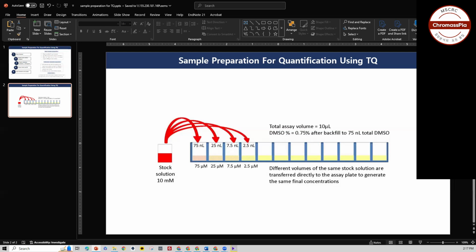Okay. Really, I agree with Imran. When he said that preparing the standard solutions from the stock, we need to be extremely precise, because I recently made a small mistake. Actually, the curve should show an R square value of more than 0.99, otherwise you will get wrong values. So when you are preparing your 5 standard solutions, you need to be extremely precise and try not to make any mistake.